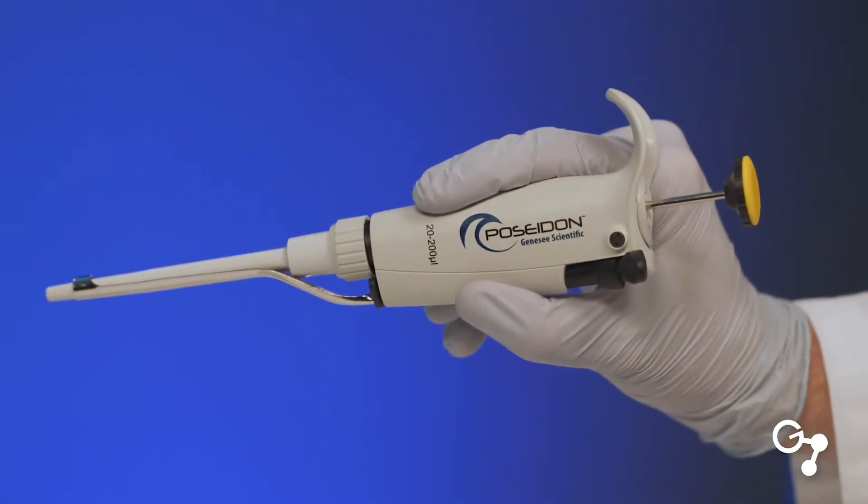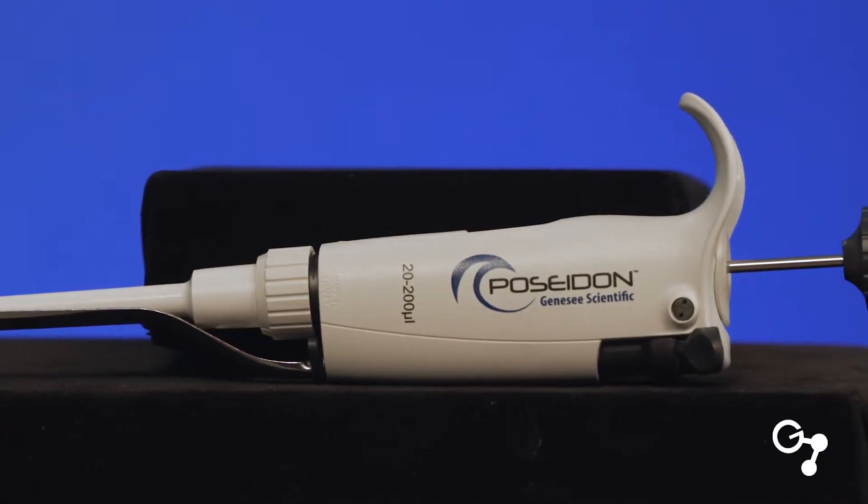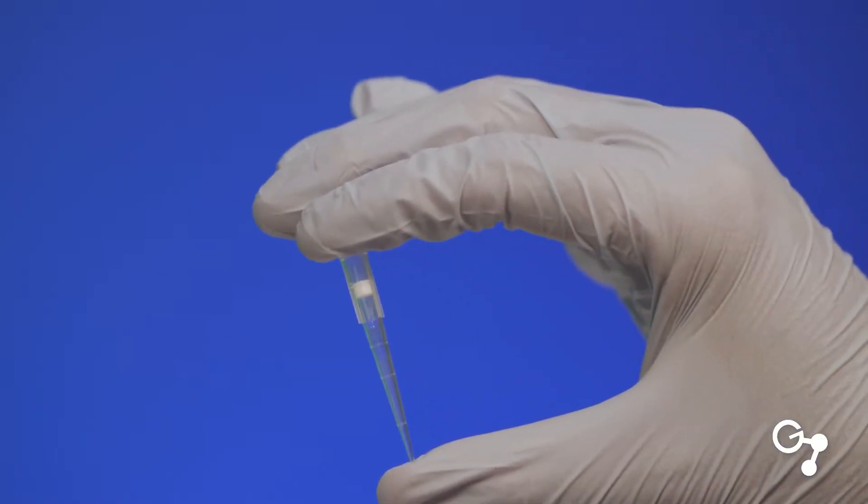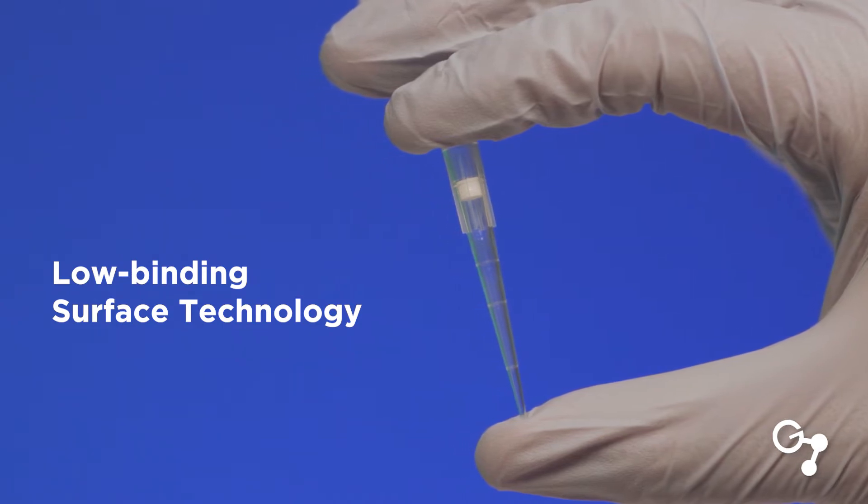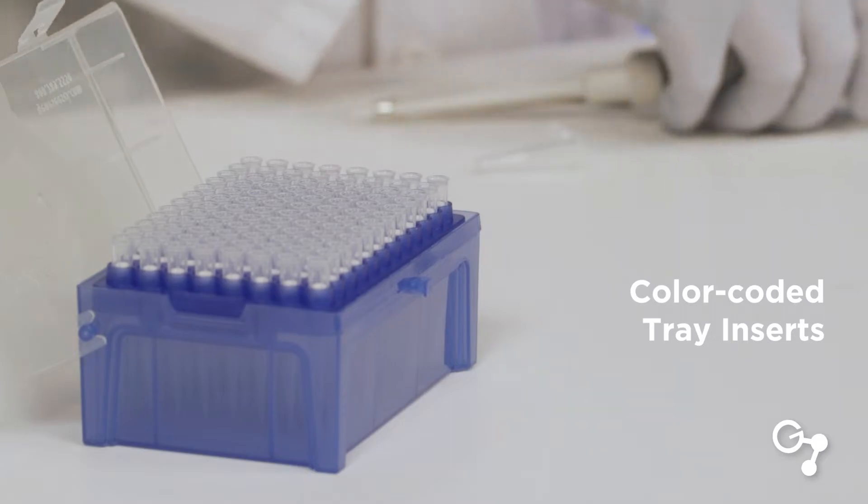Our tips are a universal fit for almost all research-grade pipetters. These tips are made with low-binding surface technology to virtually eliminate sample holdup, and feature color-coded tray inserts for quick and easy identification.